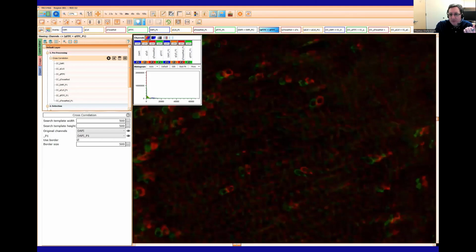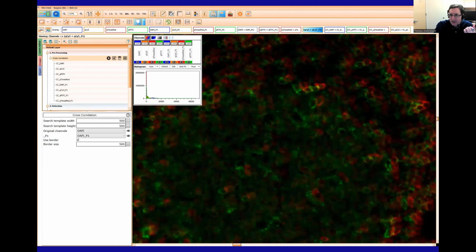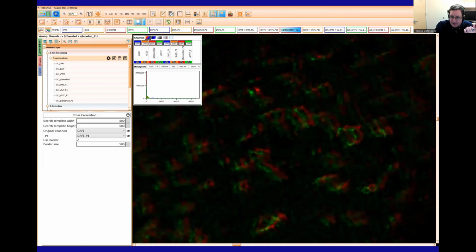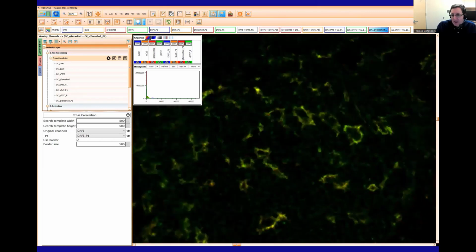And here's the FITC channel before and after. You can see that alignment was quite faithful. And then we have the Cy5 channel before and after. And here's the Texas Red channel. Of course, those weren't the fluorophores; this could have been AF 568. Sorry, I don't have the list of antibodies that we used, but I can provide it if someone needs it. This is before and after. Even in the very fine structures, I don't know if these are dendritic cells or what, but even in the very fine structures of the cells, the extensions, you can see that there's very good alignment.